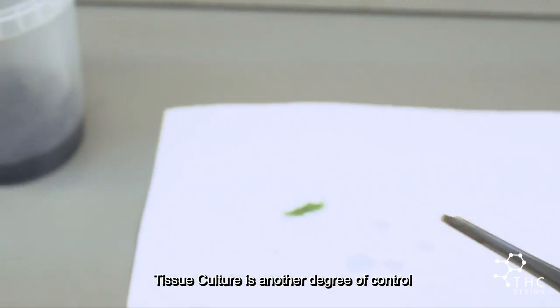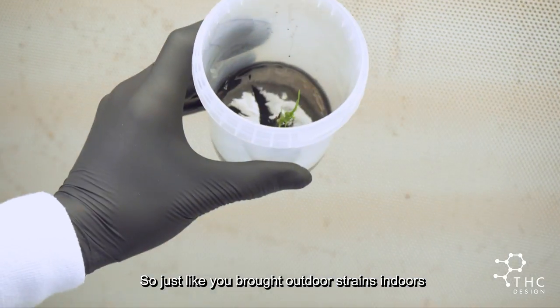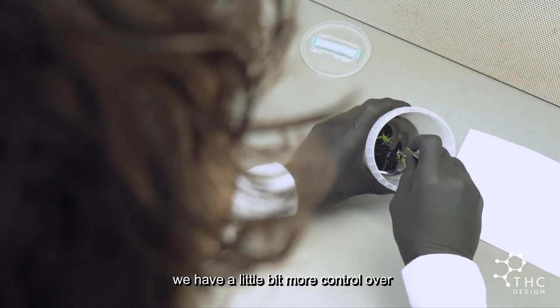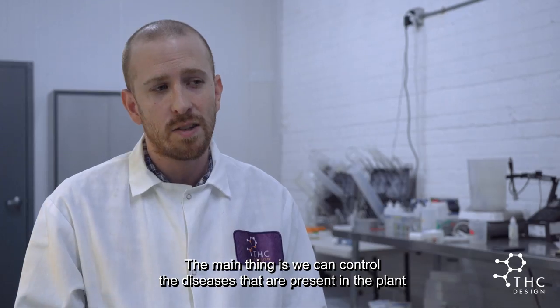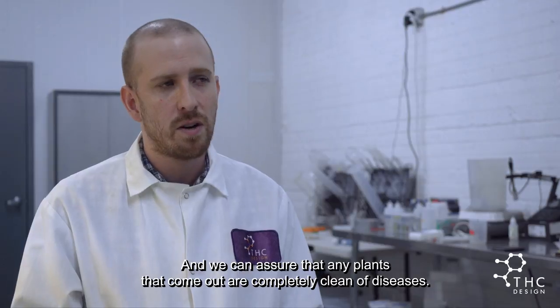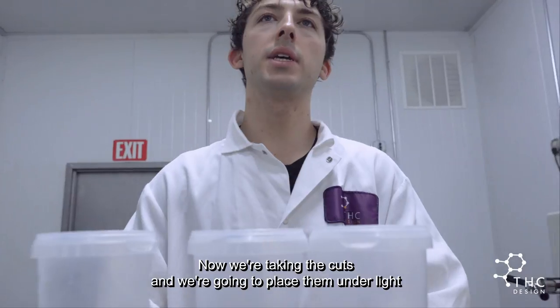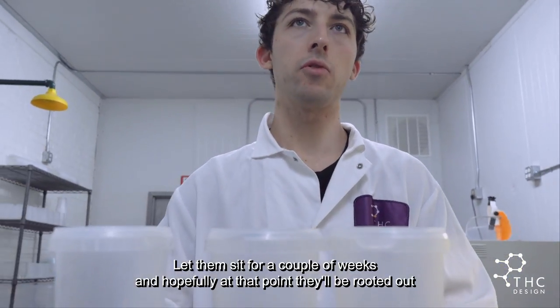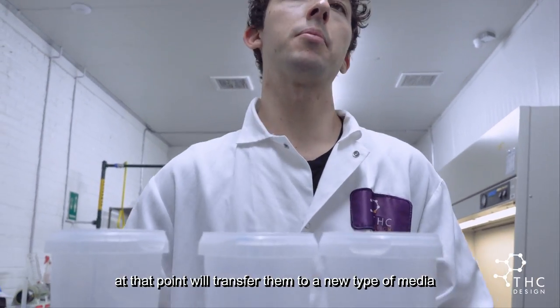Tissue culture is another degree of control. Just like you brought outdoor strains indoors and had a little more control over growing conditions, we have a little bit more control over everything about the environment the plants are grown in. The main thing is that we can control the diseases present in the plant and ensure that any plants that come out are completely clean. So now we're taking the cuts and placing them under light — let them sit for a couple of weeks, and hopefully at that point they'll be rooted out, then we'll transfer them to a new type of media.